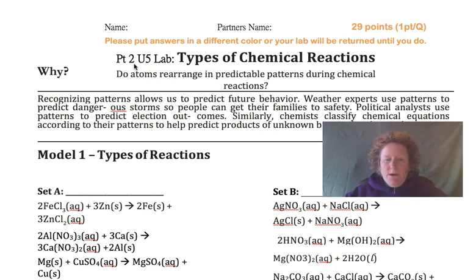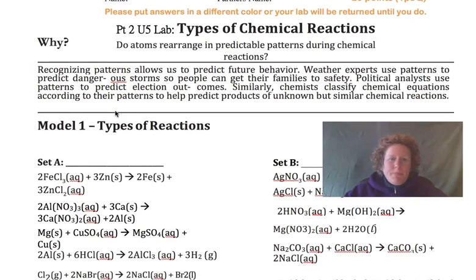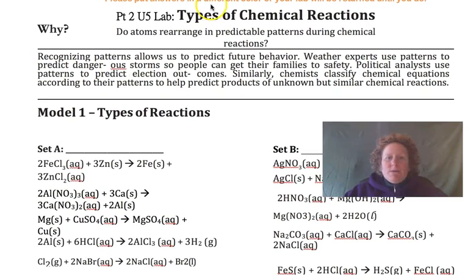I'm just going to go through how to get started so you can do this on your own. It's about types of chemical reactions. I strongly suggest that before you do this, you watch one of the videos of the day posted on types of chemical reactions that goes over the 5 types of chemical reactions that this lab is going to discuss.